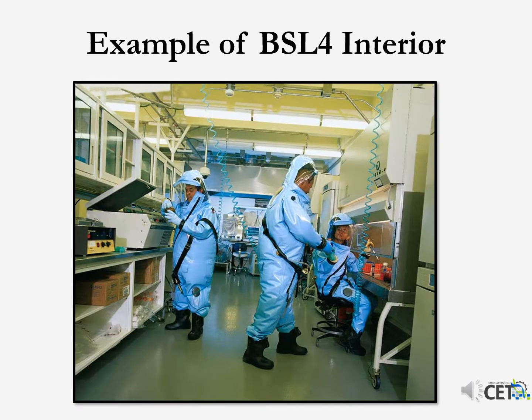This is a picture of the interior of a BSL-4 lab. BSL-4 is where the very most serious organisms are used. Those are the microorganisms that, if you become infected with them, there is no cure and no treatment. They are very likely to be lethal.